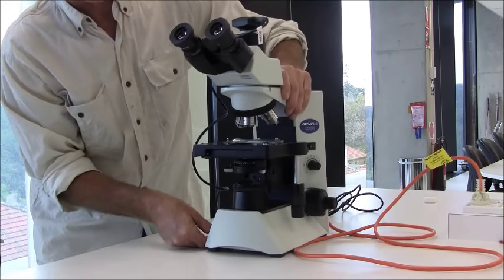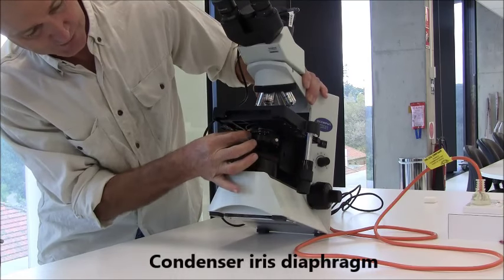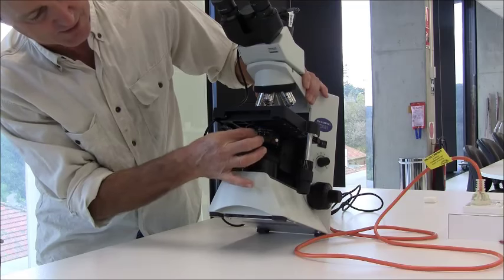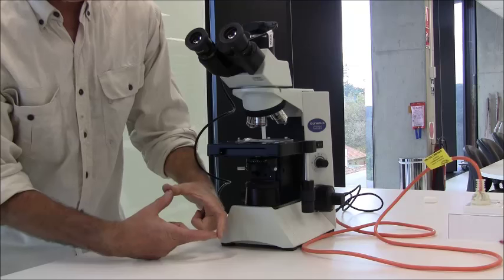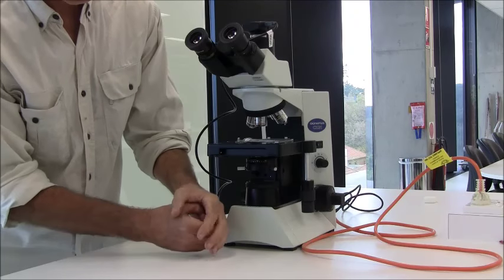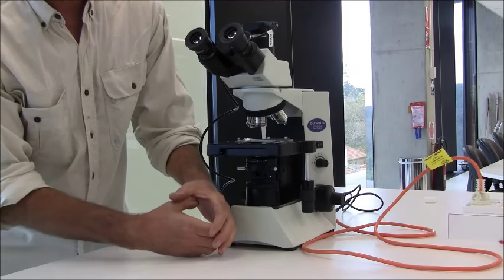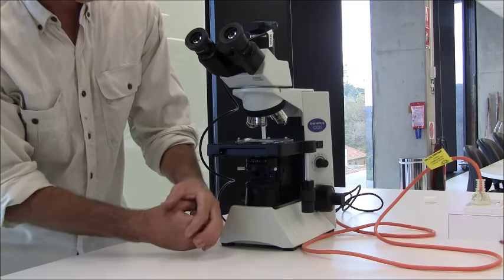On the condenser itself is another iris diaphragm, and that's an important control for varying the amount of light passing through the sample. It works — if you're familiar with cameras — by constricting or dilating a series of baffles to allow more light or less light.